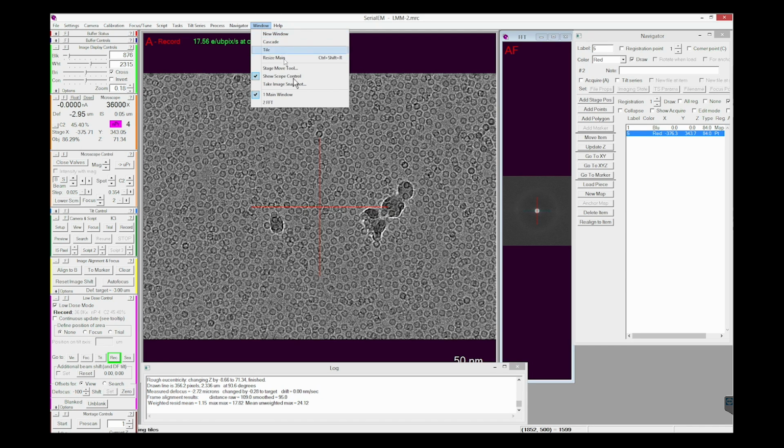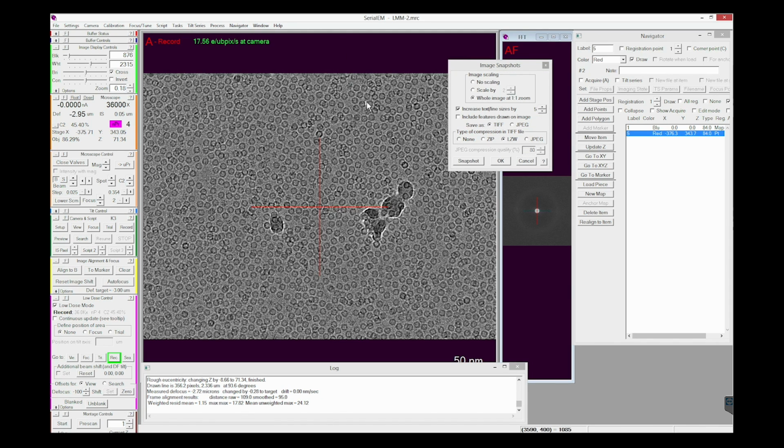So I want to now make note of that. I'd write it down in my notebook or virtual notebook, whatever you're using. Good to take notes of your impressions. You can see a little bit of transfer contamination that's over the apo. You can see some of them are overlapping, so it's not a complete monolayer, but that's all right. You have a lot of particles here.